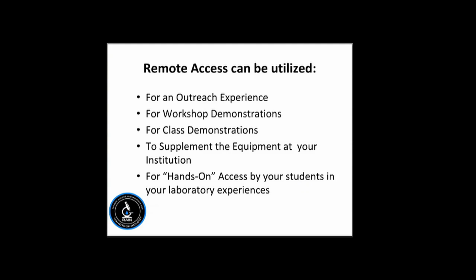This remote access, and I really could title it remote access and control. It's not just watching somebody do the work. You and or your students, preferably your students, are able to control the instruments remotely. And I think that's really a key element where they can really get some hands-on. But you can use it for an outreach experience, or a workshop or webinar demonstrations, as we're doing today. Later on in the presentation, we're going to do a live demonstration. For class demonstrations, just for a whole class, if you wanted to do a demonstration for your whole class.